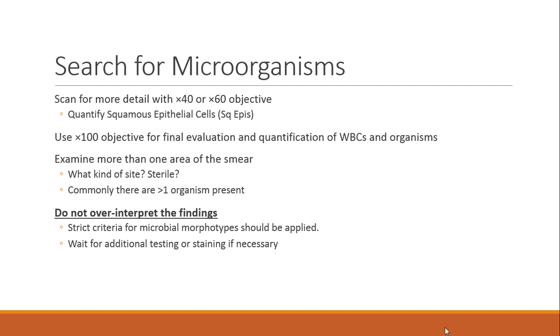You guys don't have that liberty. You'll have to give me the answer right now. But in the real world, you can go ask someone, what do you think about this gram stain? If you're unsure if it's trash, if you just see very rare gram-positive cocci, don't call it. Wait until the next day. Maybe put a question mark next to it. Don't put it in the computer and say, hey, I thought I saw this, but I'm not sure.